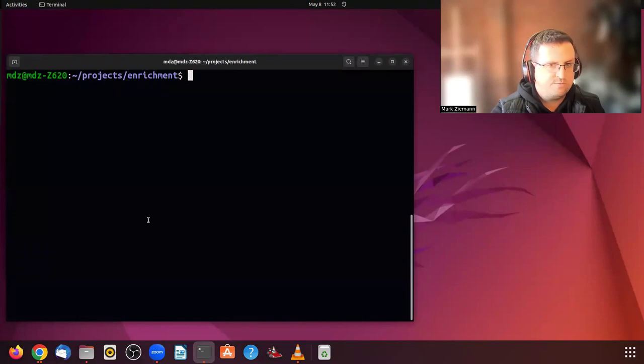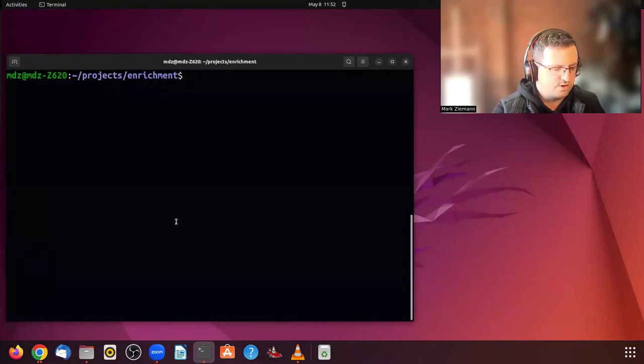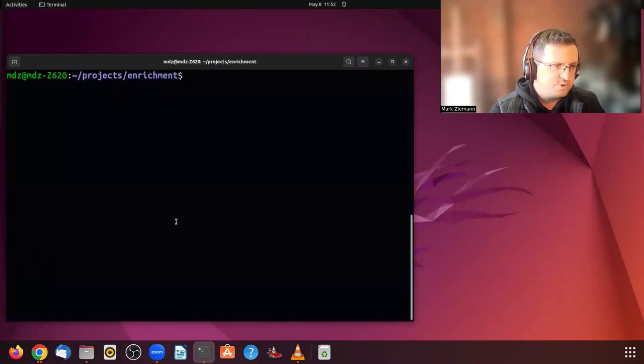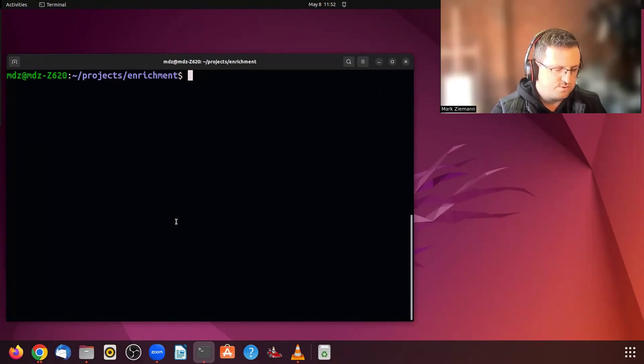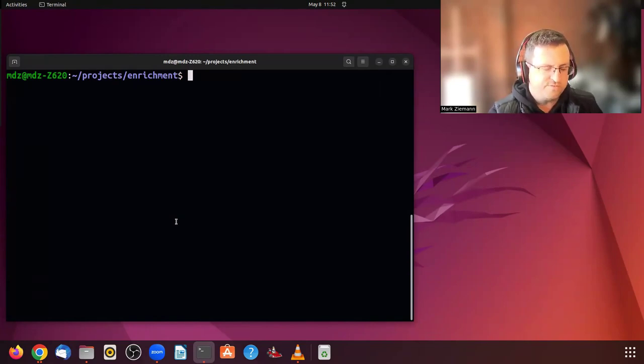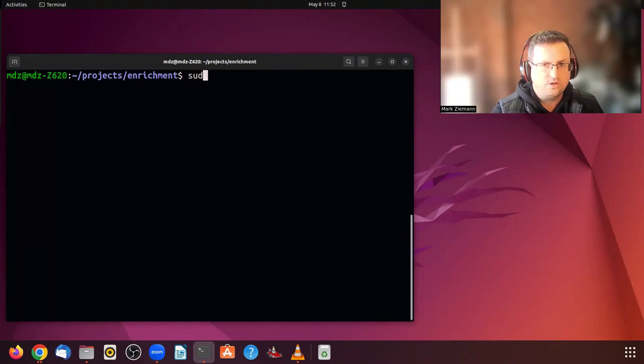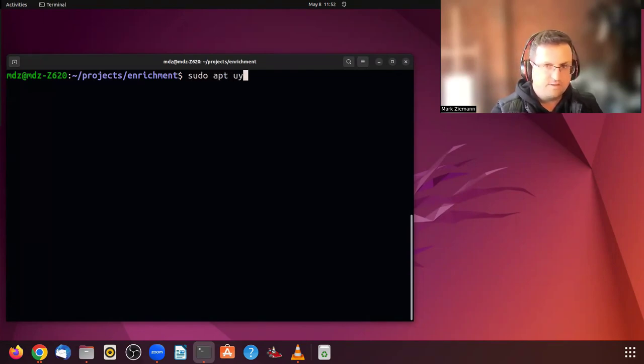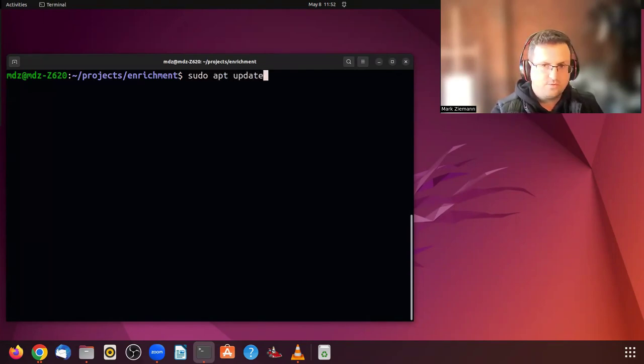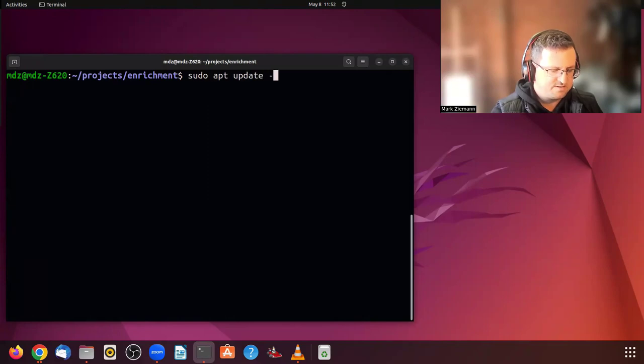Alright. So that's opening a terminal. The next thing we'll do is to install Docker. So it's good practice to update your system before installing any major packages. So we'll do that first with update.